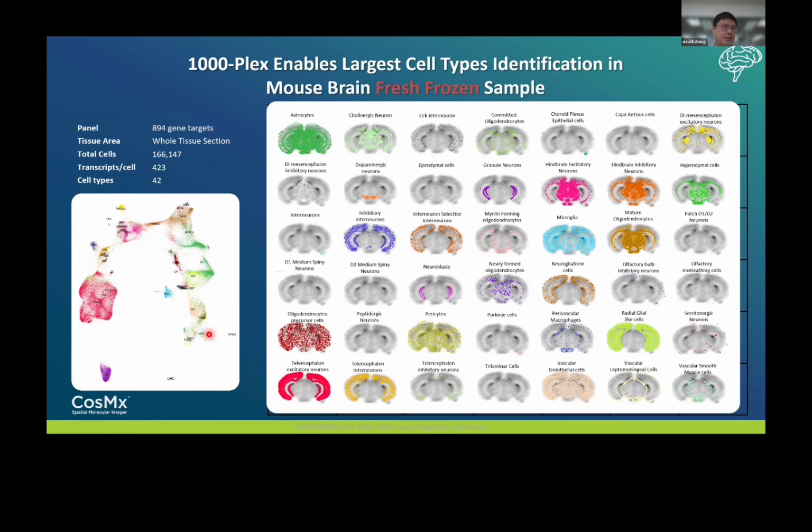But technically it's not a 3D or actual reflection of the distribution of the different cell types of the tissue. It basically just tells you there are different cell types, and how different they are in terms of the expression profile.